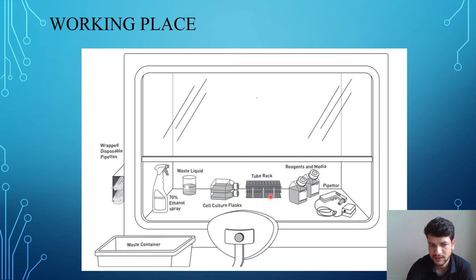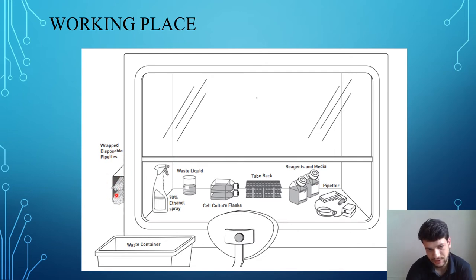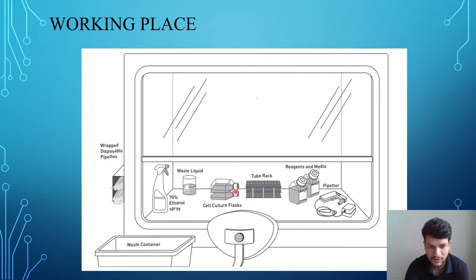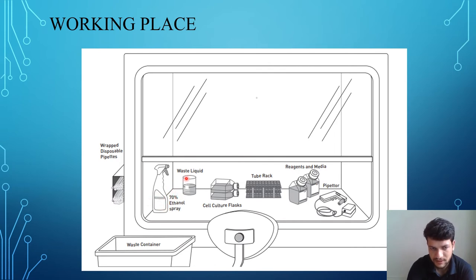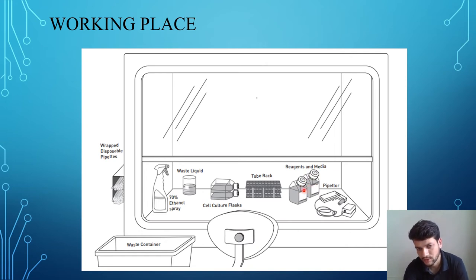Before working in the laminar airflow there is a UV lamp — you have to put it on for some time before working to sterilize the area. Also before working you usually wipe the working area of the laminar airflow with ethanol. Inside the laminar airflow you can see disposable pipettes placed here. Each time we have to use a disposable pipette — you cannot touch the pipette of one flask with another if the flasks contain different cells.